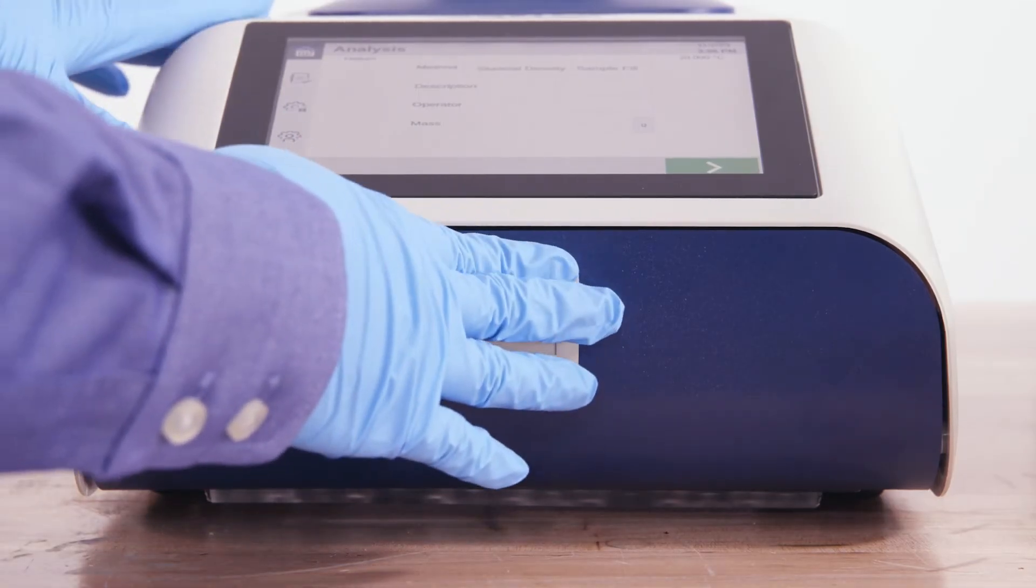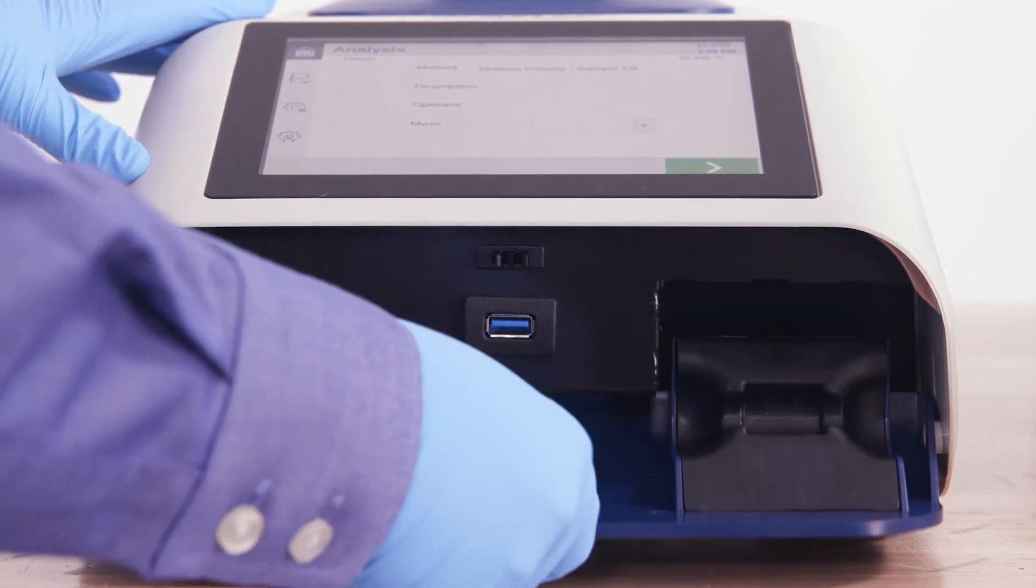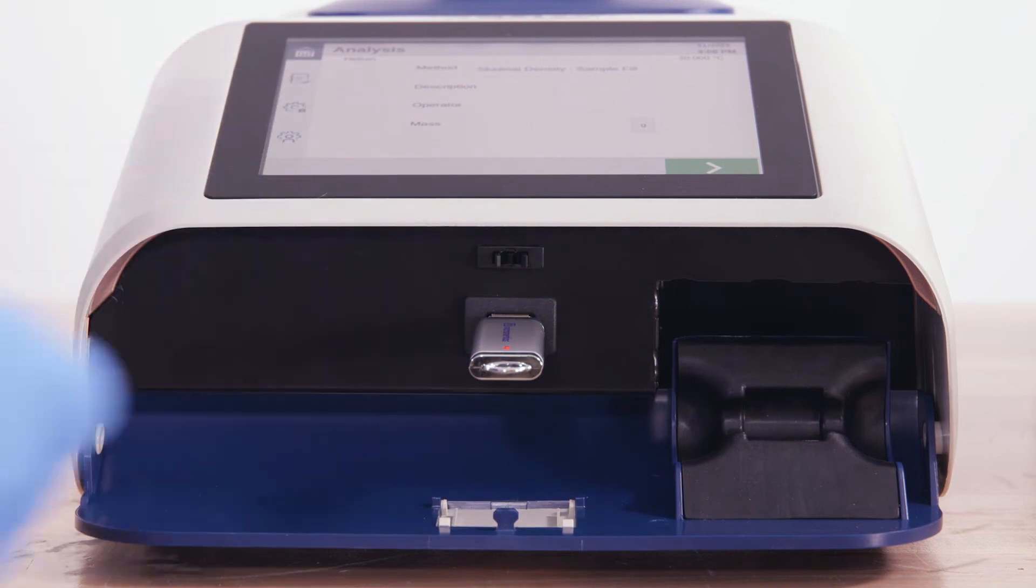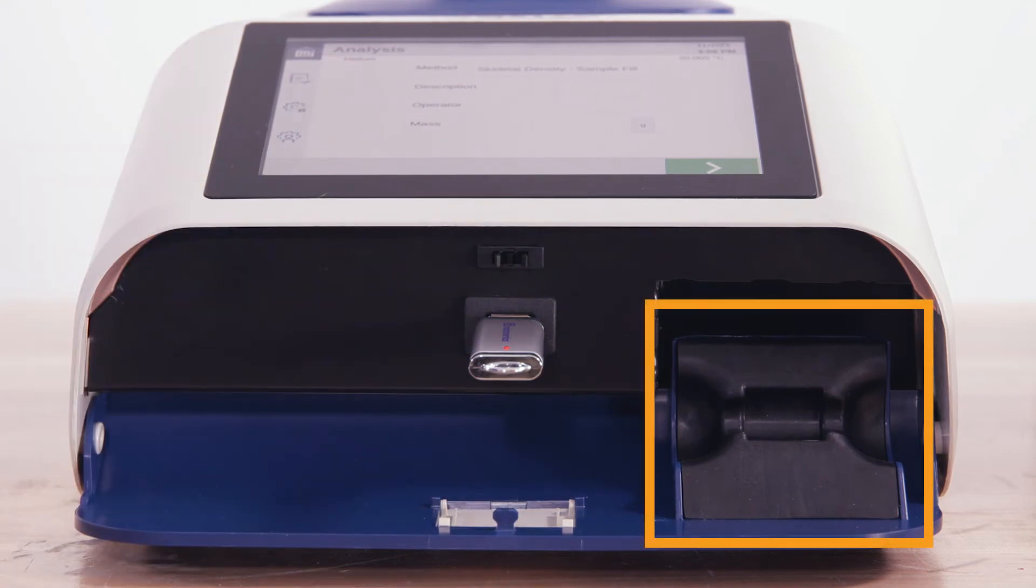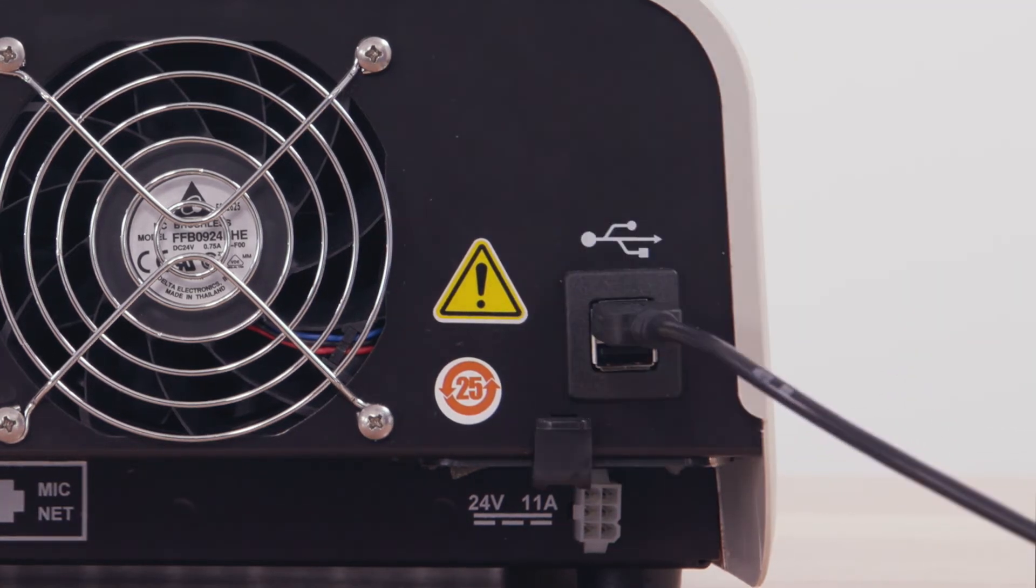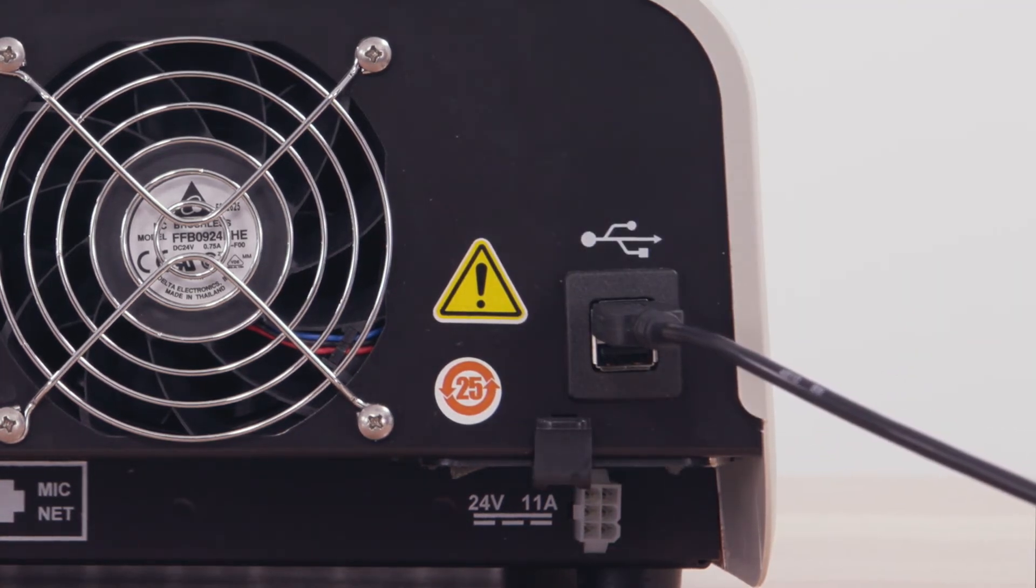The AccuPIC has a USB port for a USB stick to export data, as well as a calibration sphere storage. There are more USB ports in the back to be connected to a balance, keyboard and mouse.